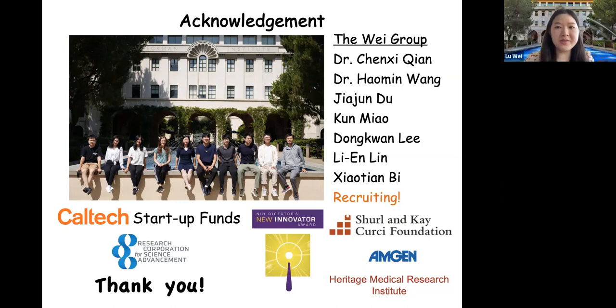Right. So in the case of the Raman dye approach, it would be very similar to the fluorophore approach or the mass spec isotope antibody labeling approach. So it's a similar antibody labeling scheme. I think the advantage is that we add more multiplexity, so we can reduce the runs and try to do everything in a single shot to reduce any possibility of sample deterioration. So that's, I guess, the Raman dye approach.